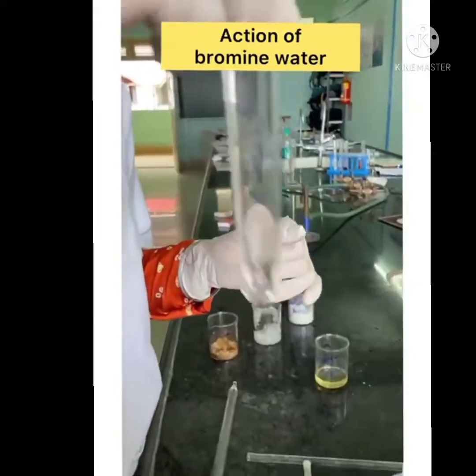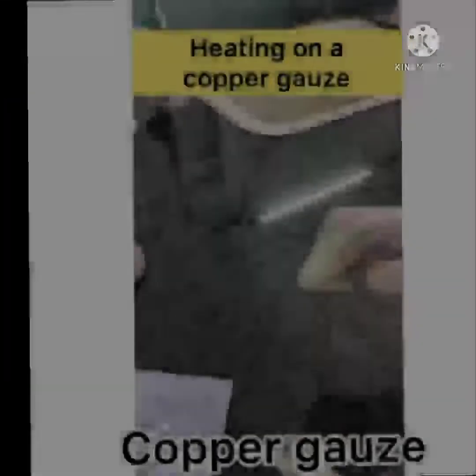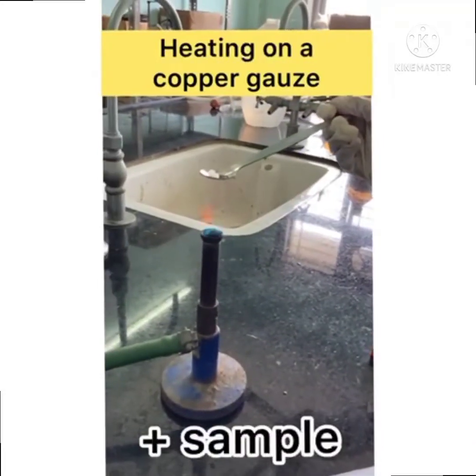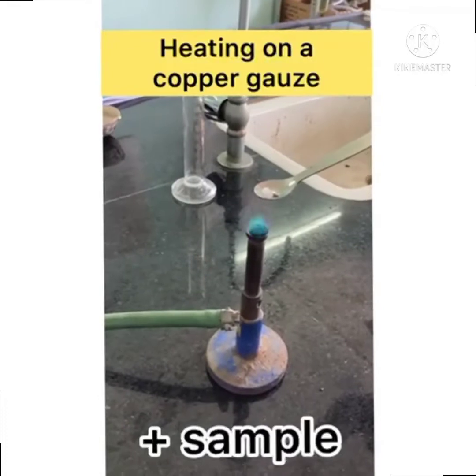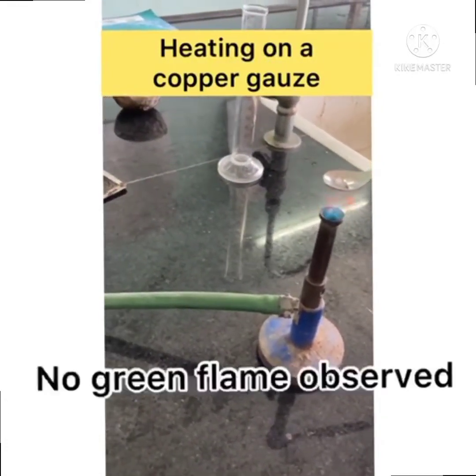A test for aromaticity and aliphaticity — heating on copper gauze. Take a small copper foil and heat it in the flame. Place 0.2 gram of substance and heat in a flame. In this test, no green flame is observed, which means the halogen is absent.